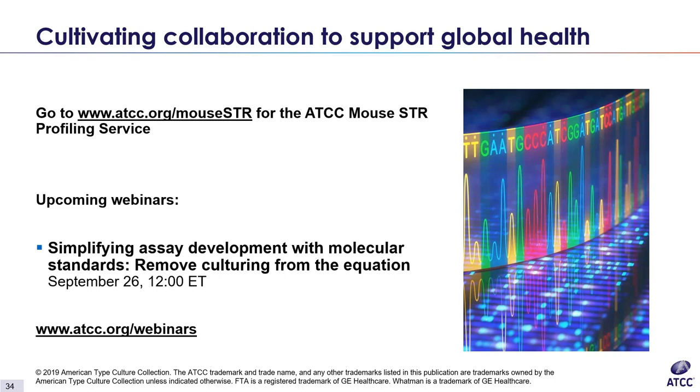Okay, great. Another one that just came in. I noticed that in some of the STR profiles you showed there were other smaller peaks hugging the main peak. Why is this, and what is the cause of this? Right, and someone was asking that about the mouse loci as well too. So that's a good catch.